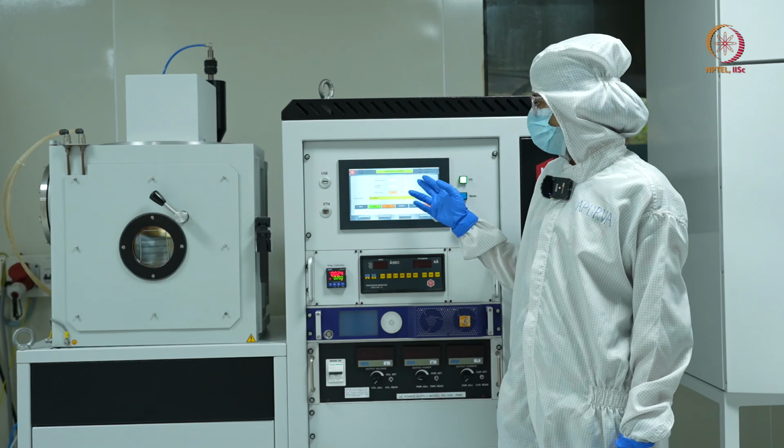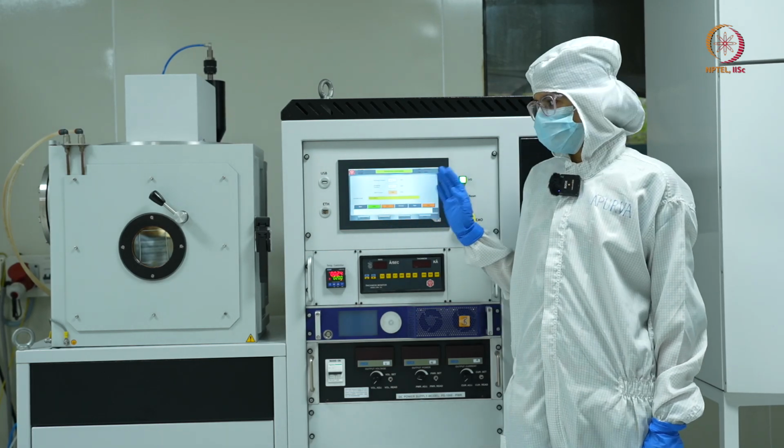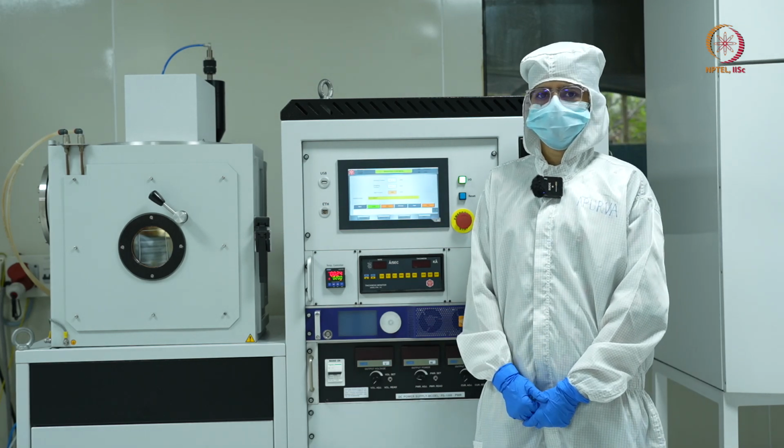Sufficient vacuum has been reached so that we can stop the tool. Now we'll stop the tool, and that's all for today's lab session. Thank you.